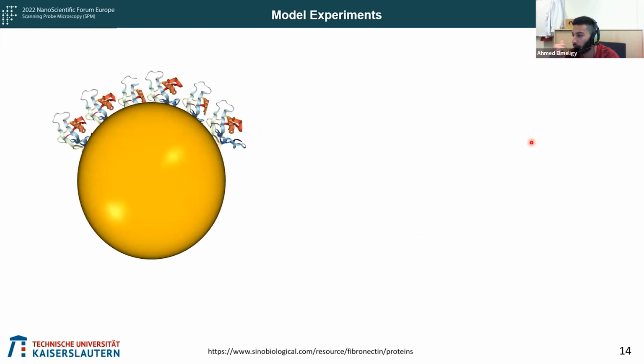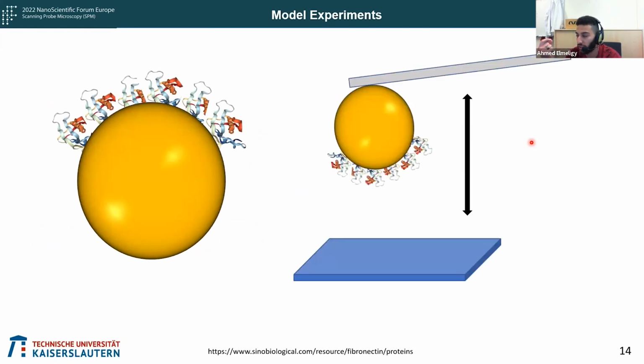For wrapping up, what I'm trying to tell you is that this particle is going to be modified later on with one single biomolecule or protein, and then approached to the surface to see how the force curve differs from all the particles attached to the titanium dioxide surface to just one molecular particle. So we're taking the big picture and then going to the smaller picture later.